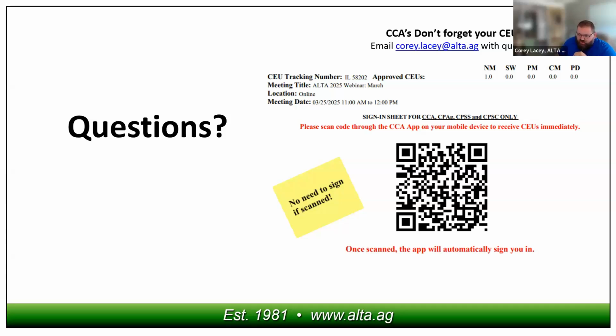One other question that came up in the chat: I have a question about running mineral digest of soil samples on ICP-OES. What is a good practice to sample soil for mineral digest? Should we focus only on finely ground soil, complete powder, or take a representative sample with some small grains?